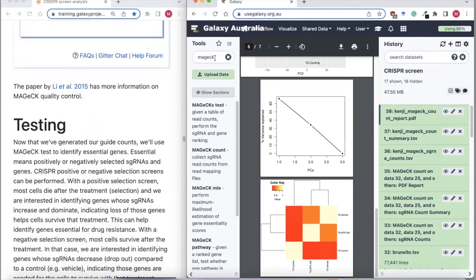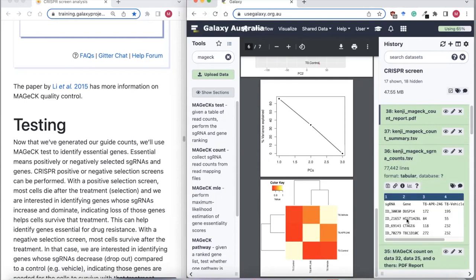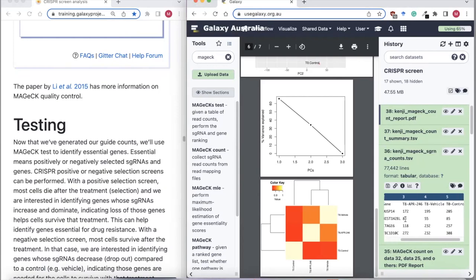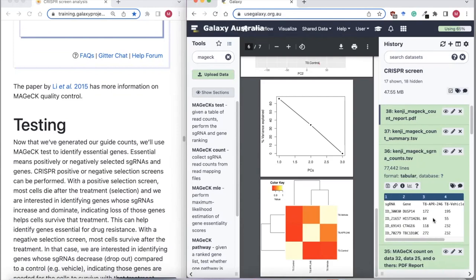Now that we've generated our counts, let's look at the actual counts file we're going to use next — we've got a row for every guide, saying what gene it's targeting, and how many counts that guide has for each of our three samples. We're going to input that into MAGeCK test to compare our conditions of interest.